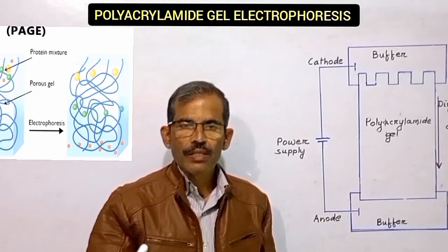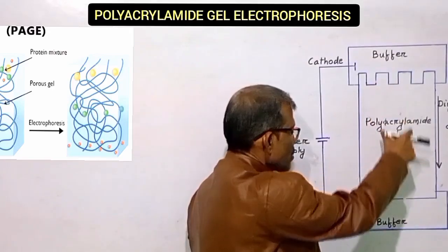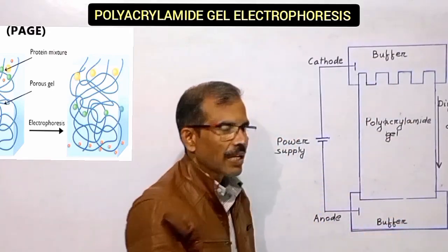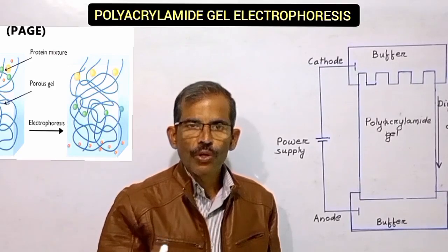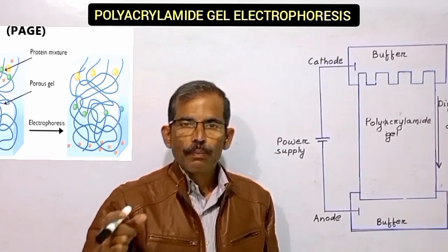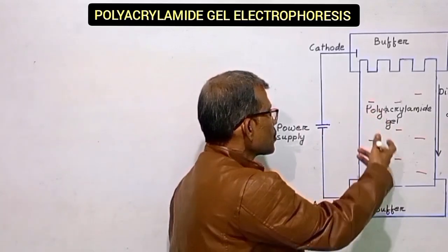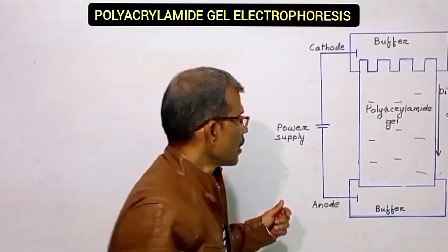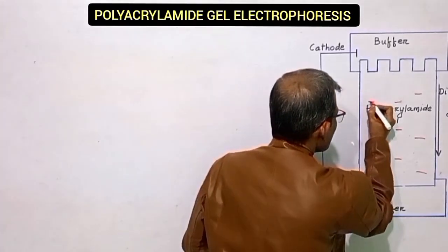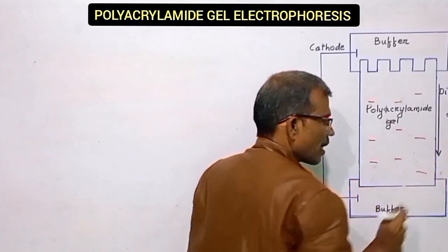Because of this, smaller molecules will move at the fastest velocity through the gel, whereas the largest molecules will move very slowly. Due to differences in size, running through the gel for some time will result in the separation of charged sample molecules into distinct bands.